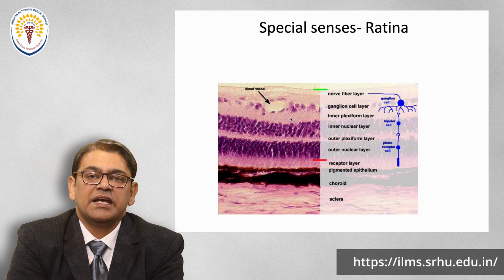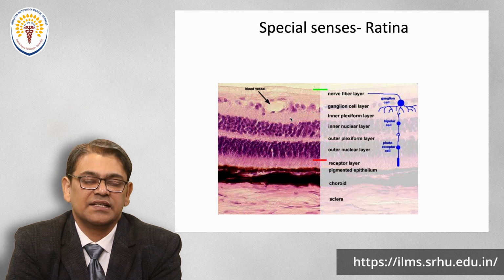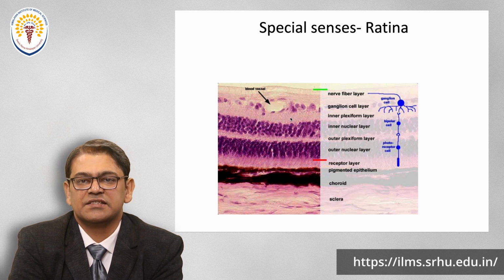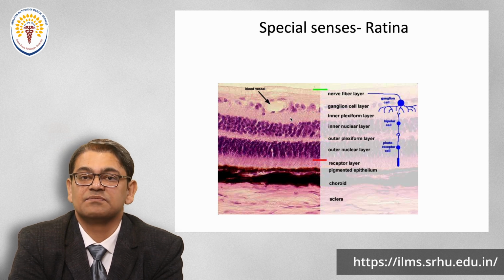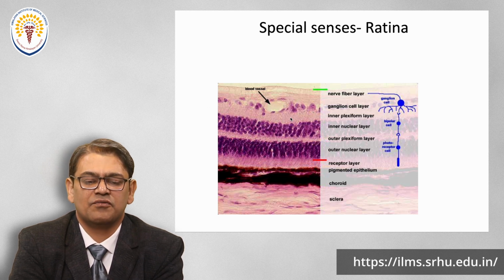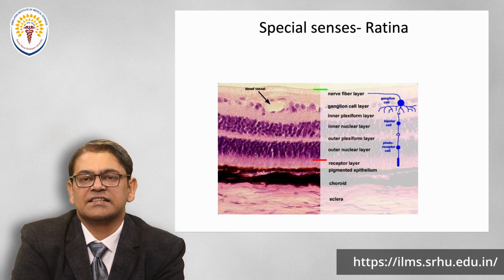Remember, pink and blue is the key, especially the blue. If you see a blue dot anywhere in the histology, that means chances are a nucleus is present somewhere, and around it you can assume at certain places cytoplasm or other structures scattered around this blue dot structure, and this gives you an idea of how the tissue may look or what organ it actually is. So this is the way of analyzing the retina.